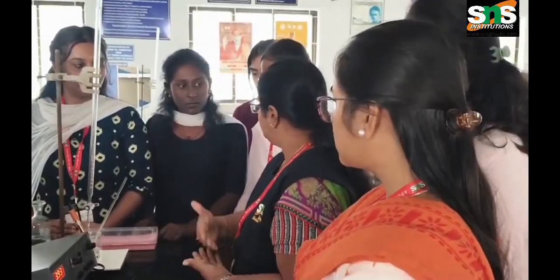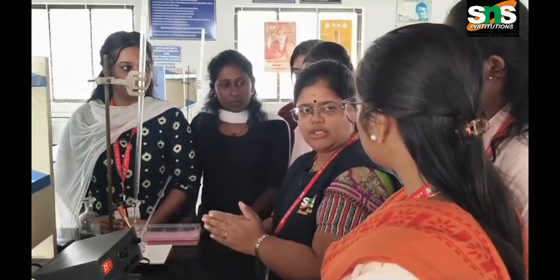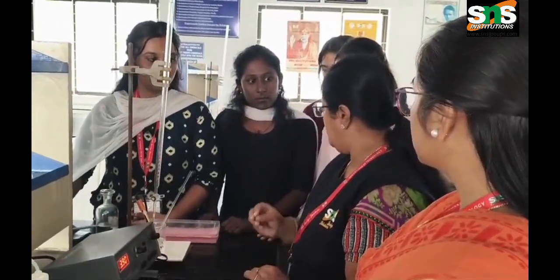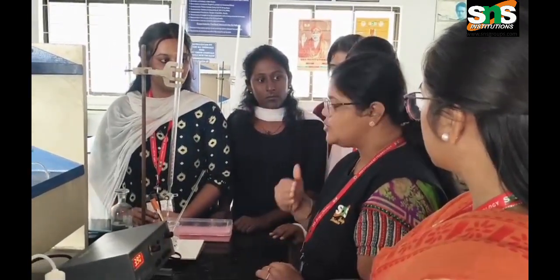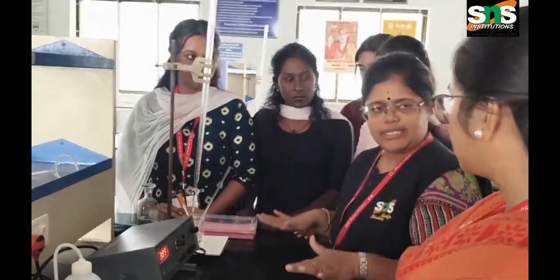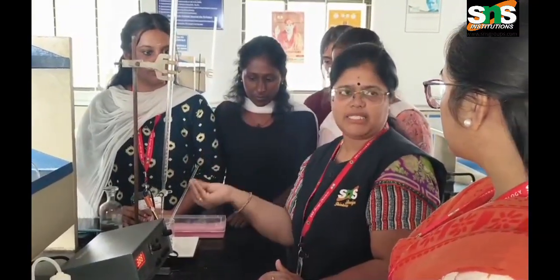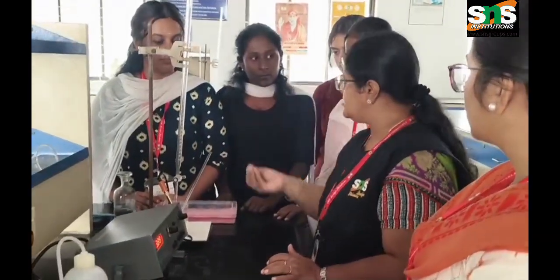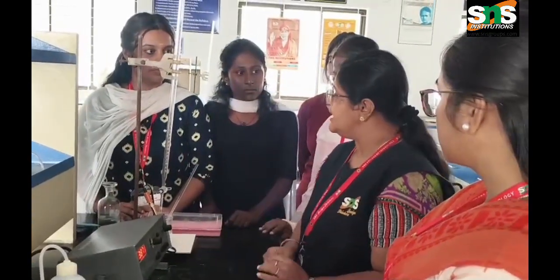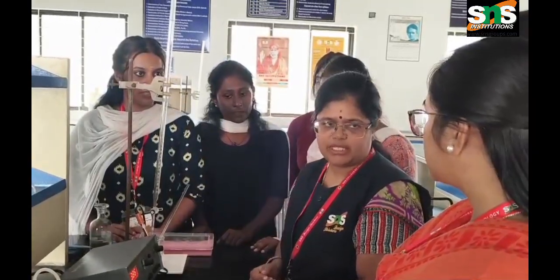After the second end point, that is once neutralization is complete, you will have a sudden increase in conductance, due to the presence of excess OH minus ions as you keep adding the base solution.